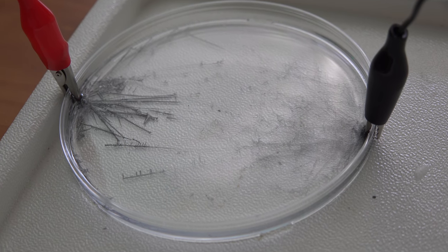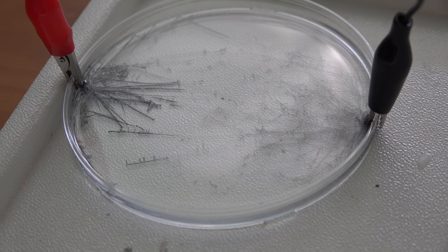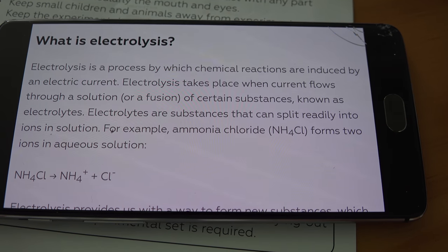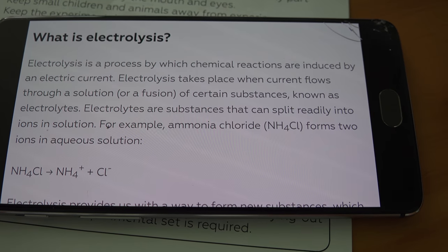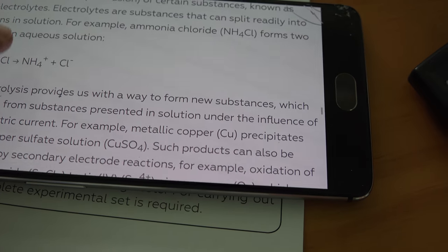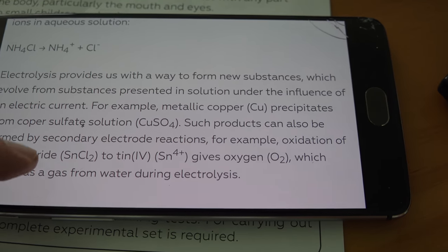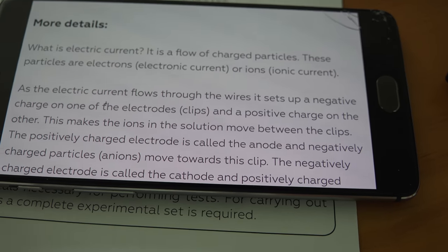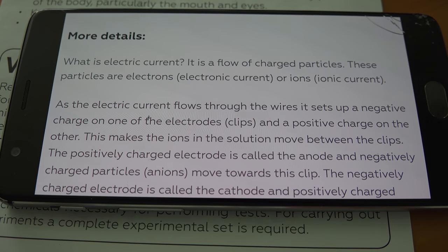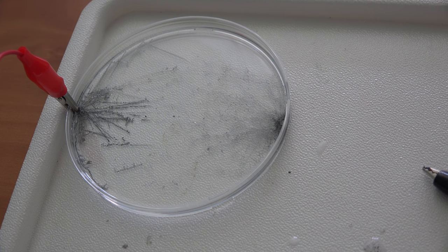Interestingly, they say that if you leave this experiment running, the ends of the alligator clips in the solution will actually dissolve away and form part of the structure — pretty cool. With the experiment completed, you can go to the app and read more about what was happening. We were performing electrolysis — the other kind of electrolysis. It explains how electricity is used, and for people with gold-plated jewelry, it helps you understand how you get a coating of another metal on a ring or necklace — you don't just paint it on. Several minutes after disconnecting the power, the dendrites do look like they're dissolving.